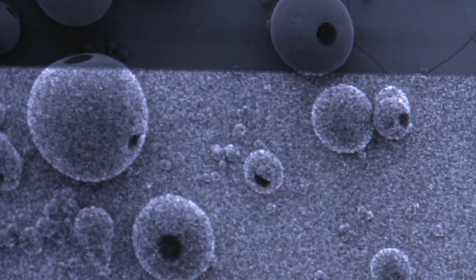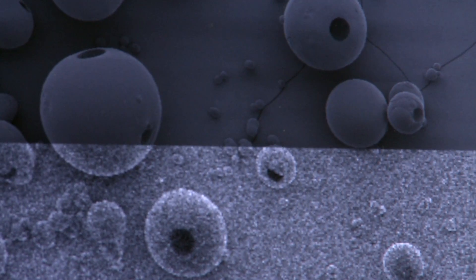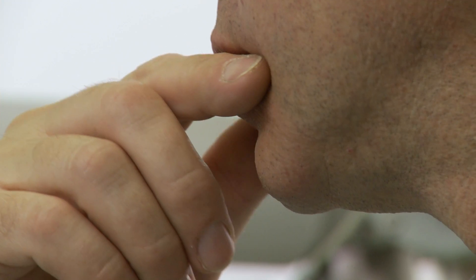The lowest magnification I can get on this is probably about 40 times and the highest magnification I can go up to is 3 million on this one. I think a good image must have a combination of being good to look at and scientifically informative.